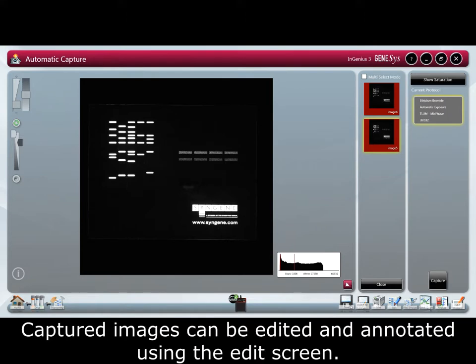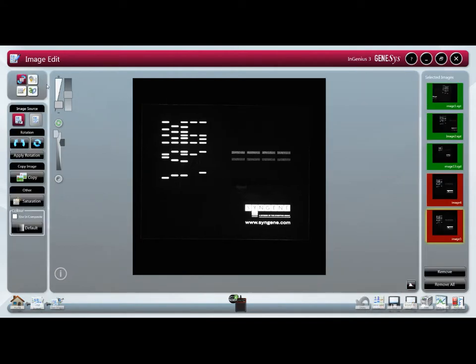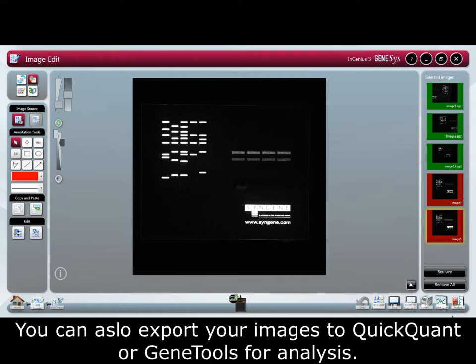Captured images can be edited and annotated using the edit screen. You can also export your images to QuickQuant or GeneTools for analysis.